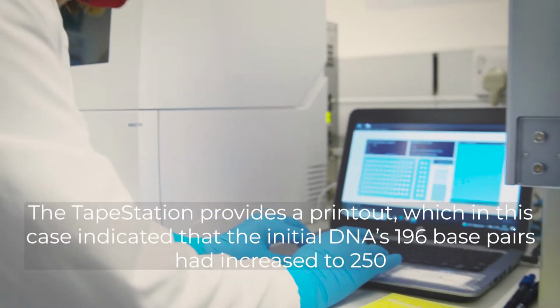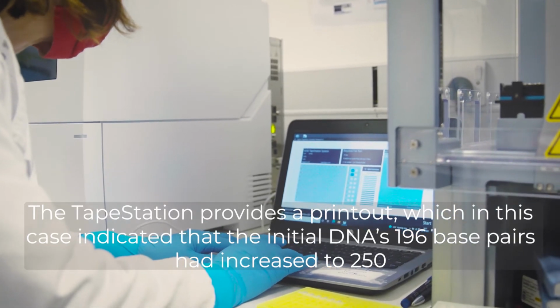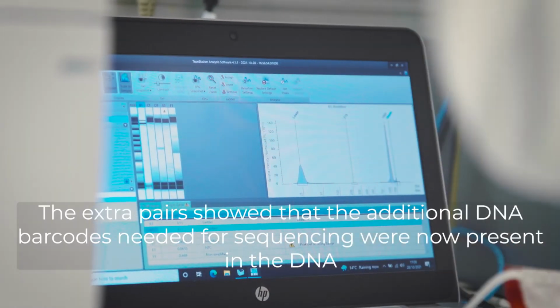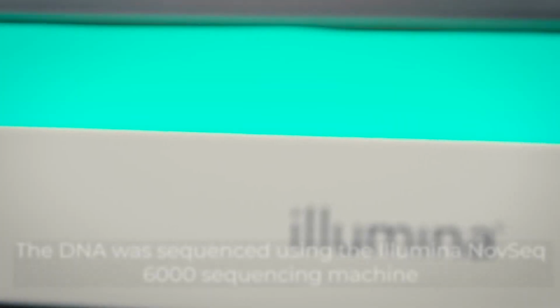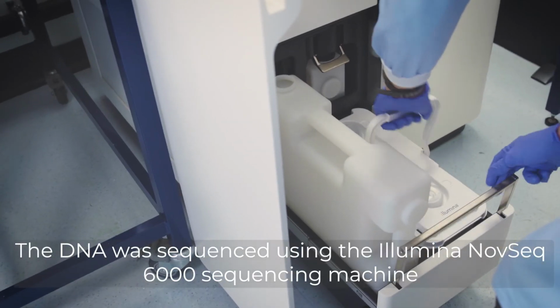The TapeStation provides a printout, which in this case indicated that the initial DNA's 196 base pairs had increased to 250. The extra base pairs showed that the additional DNA barcodes needed for sequencing were now present in the DNA. The DNA was then sequenced using the Illumina NovaSeq 6000 sequencing machine.